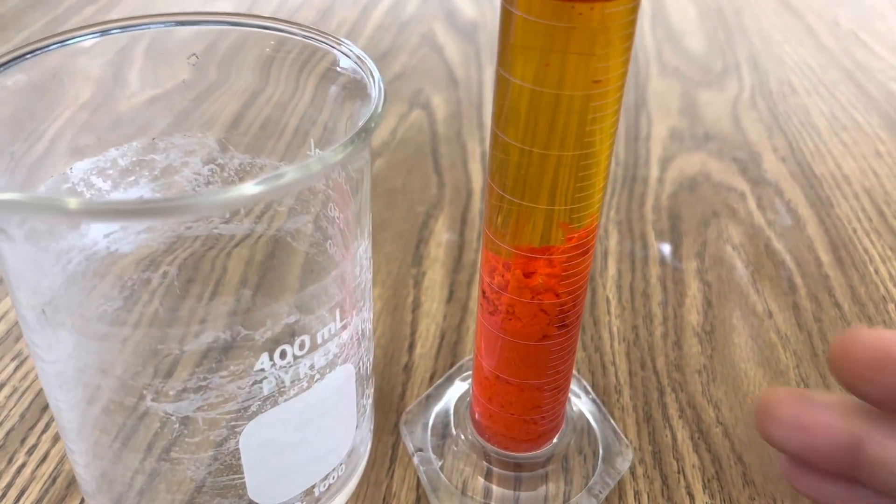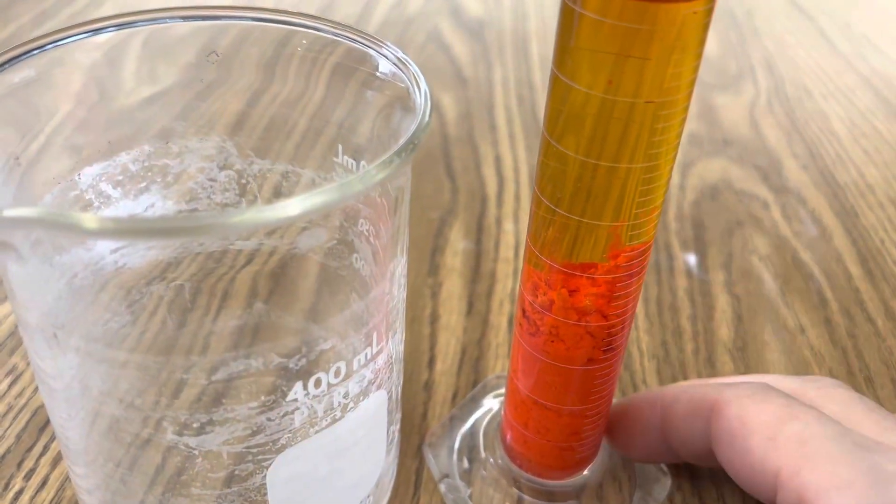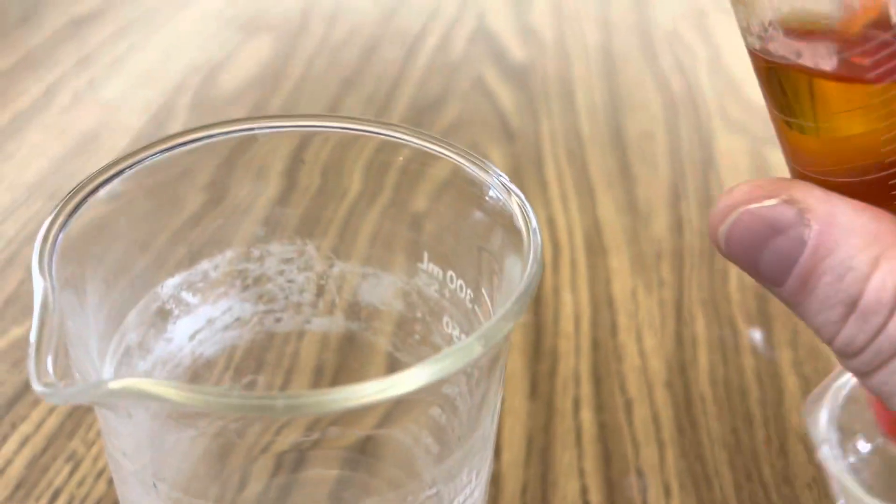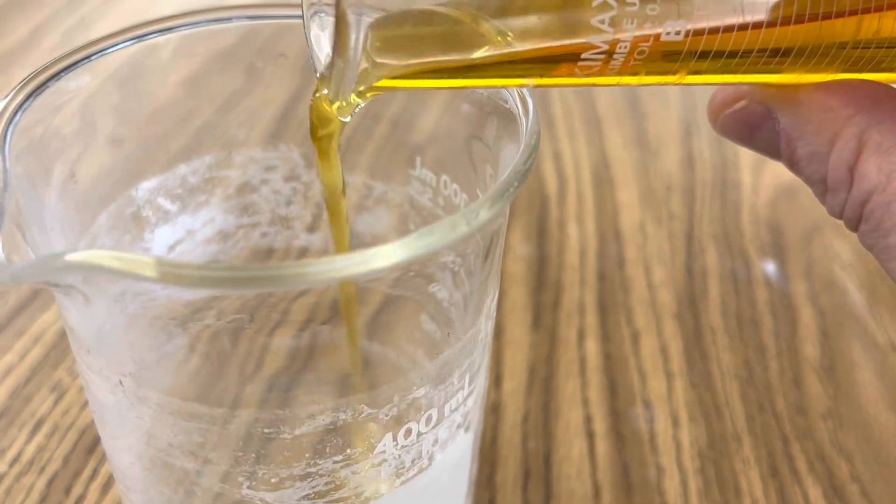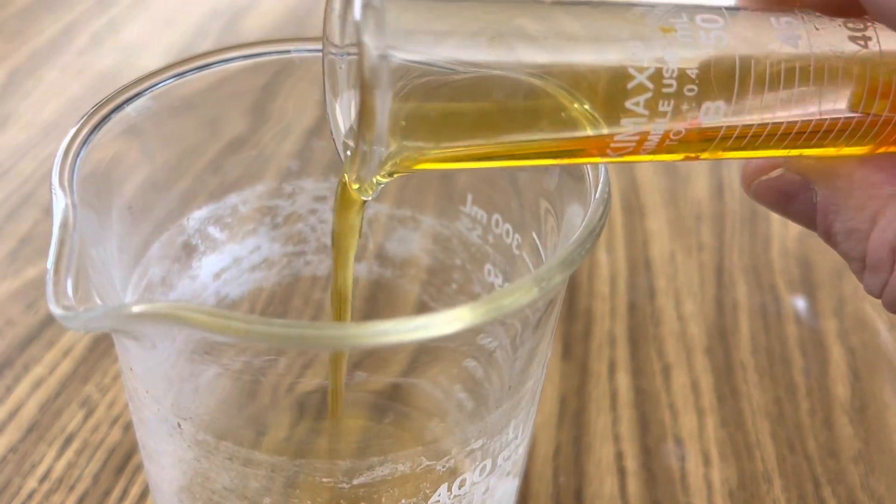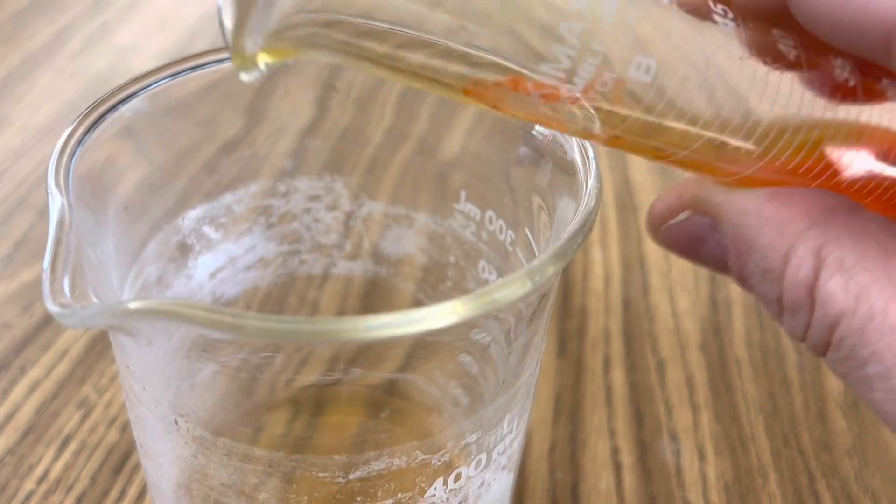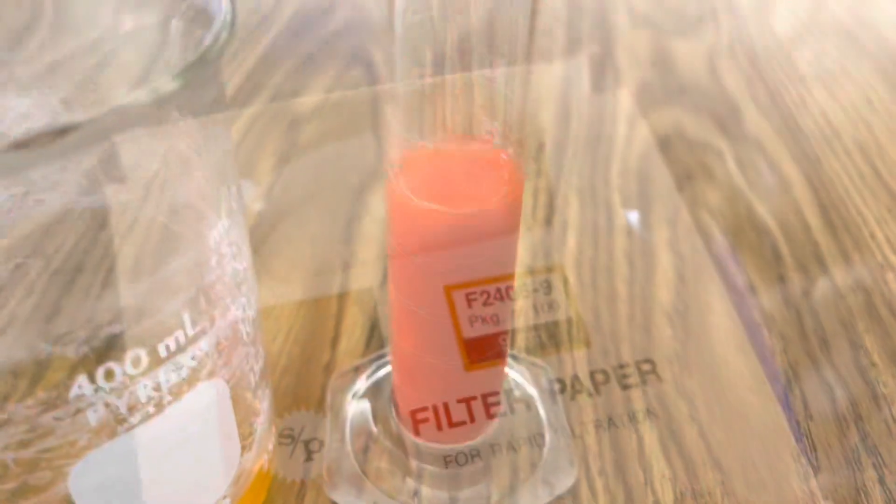Okay now in order to save my precipitant, my mercury iodide, I'm going to decant some of it off the top into my beaker and then I'm going to use vacuum filtration to collect the rest of it.